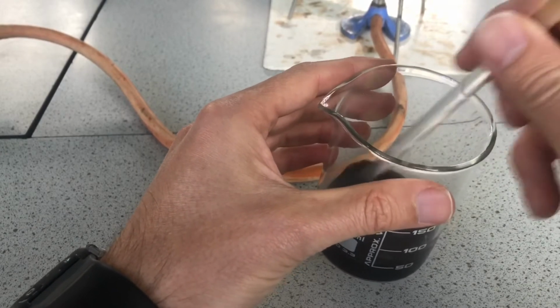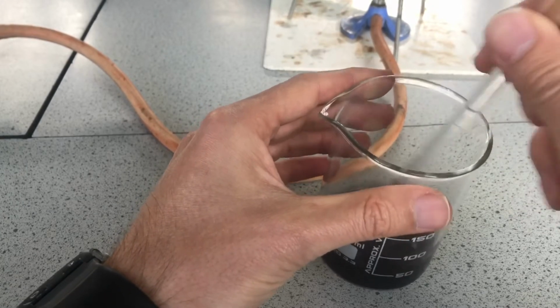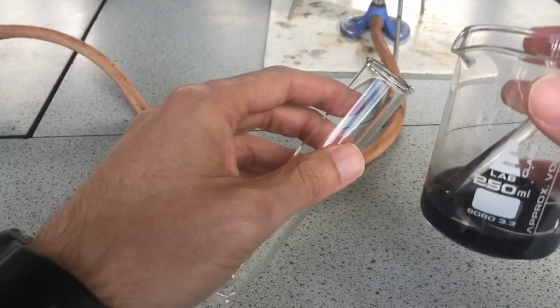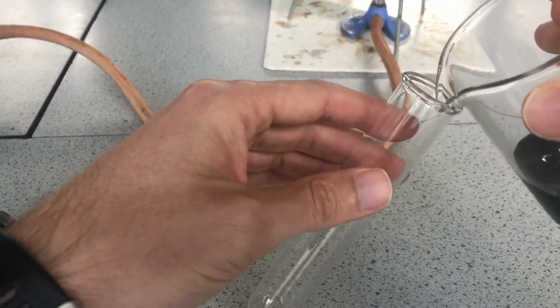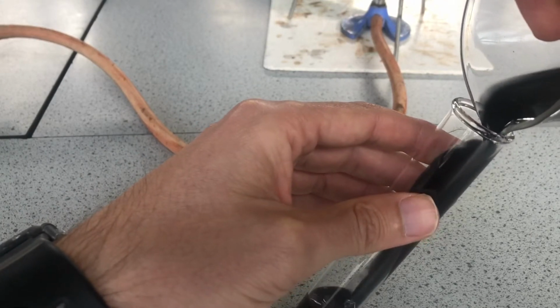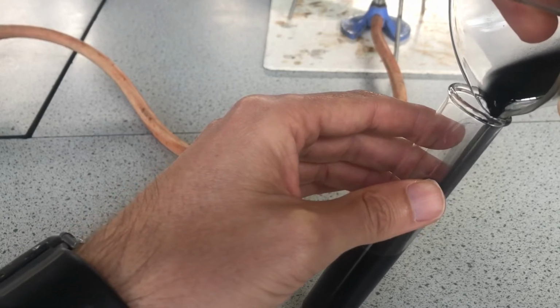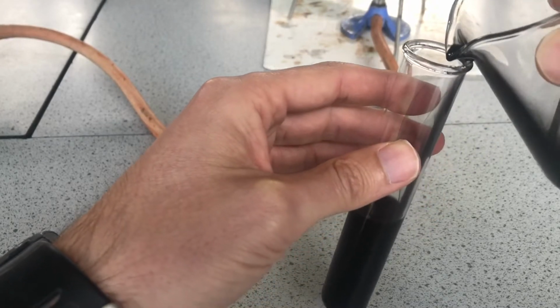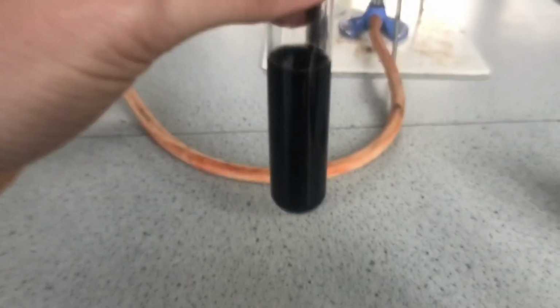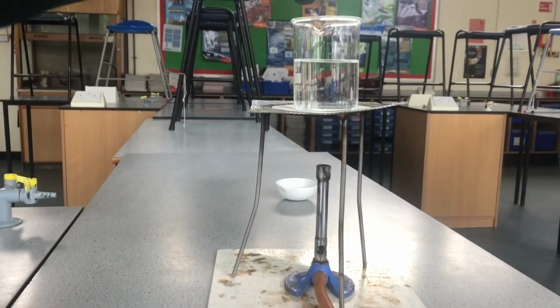In a moment, I'm going to put it into a water bath to warm it up, to ensure all those sulfuric acid particles react as well. So we're going to transfer this now to a water bath. The water bath I've got set up on a Bunsen burner. I'm heating some water, so we will heat it in that water bath. I don't need to use everything from the beaker, because as I say, we're not doing this in an exact way. So I'm just going to put this into our water bath now, and that can heat there.